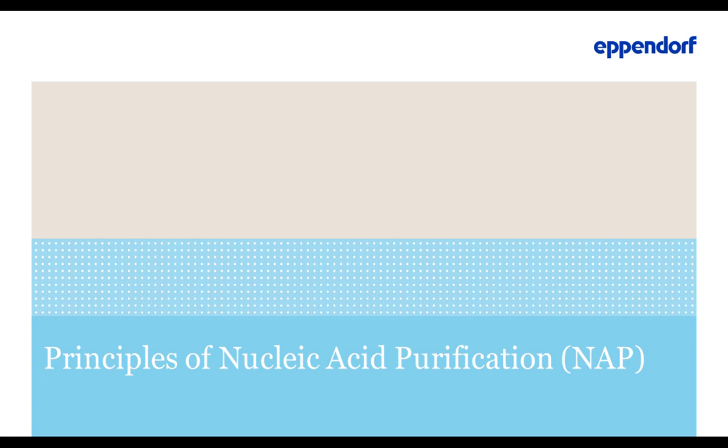purification. Because when I think back to my time in the lab as a student, maybe I wasn't really thinking about what step in the purification protocol does what. What is this buffer used for? What is the purpose of this buffer? Why is it composed like this?